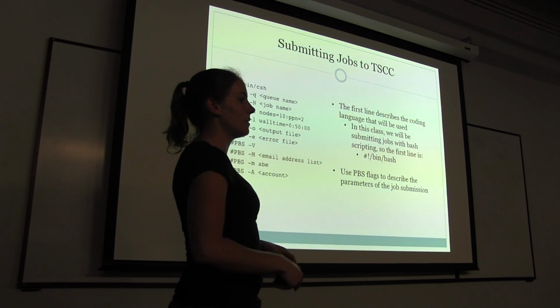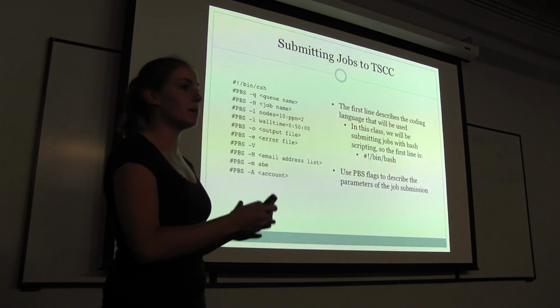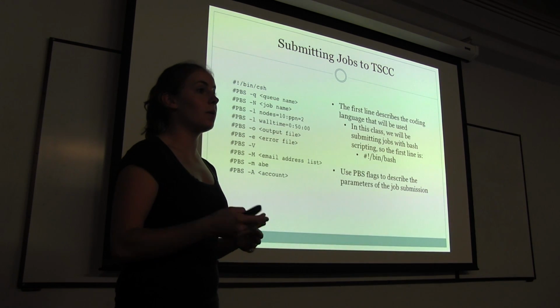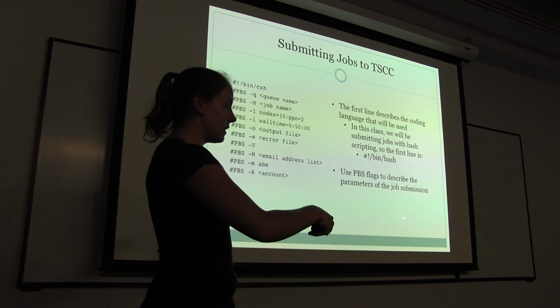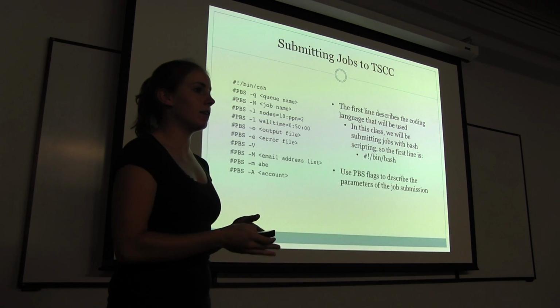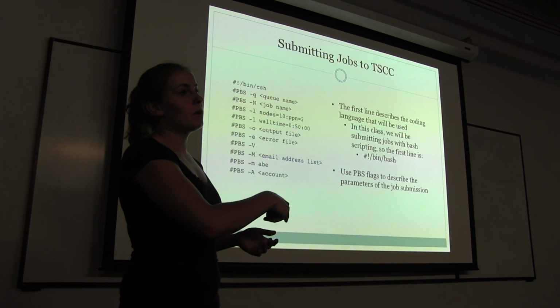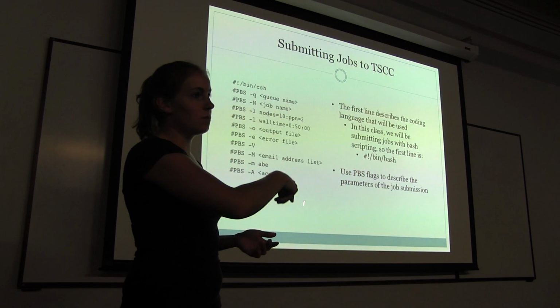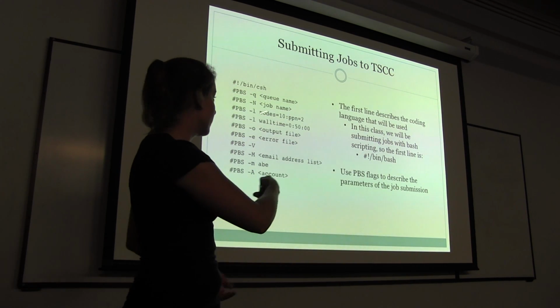So that will all be specified in the specific command that you run. Just like when we ran fastqc, we specified the output directory of where we wanted those output files to go. So as you run a command down here, if whatever it is has a flag for the output, like fastqc did, and you give it -o, that will actually be the location where all of your created files will go. They won't go to this out file.